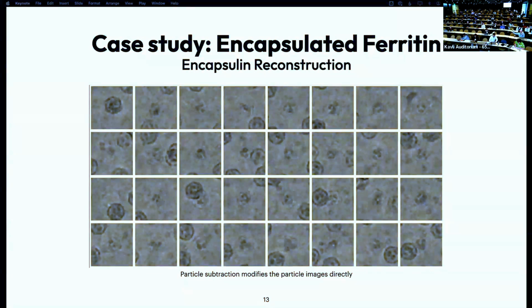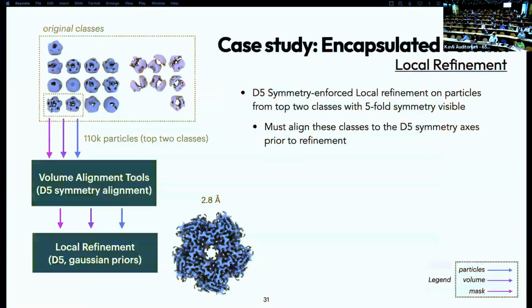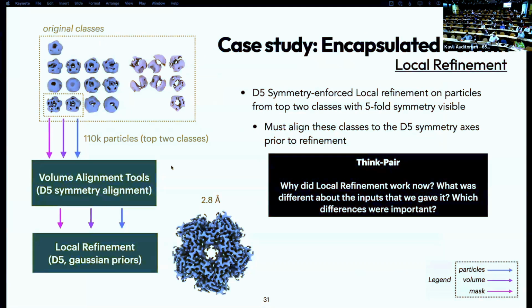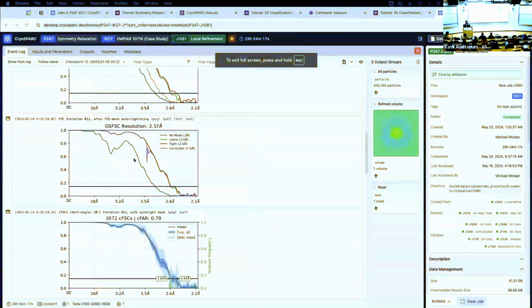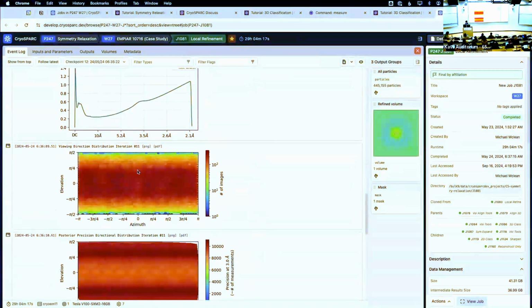Yeah, it's a really good question. That's just something that everyone worries about. Are our particles overlapping? Well, almost all of them are. No, that's a good point. My guess is, and okay, I can actually take a look. One thing that I want to look at before I try to answer that question is a job that I ran, and the orientation distribution is pretty uniform.